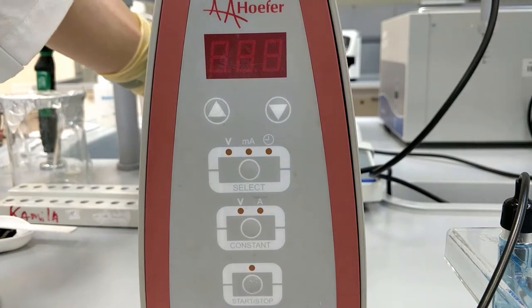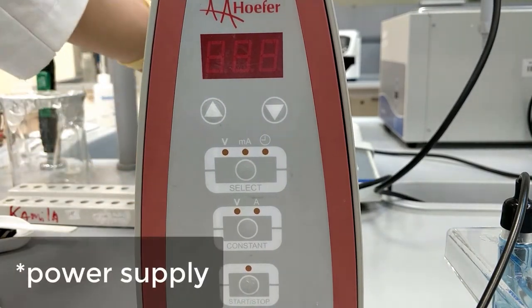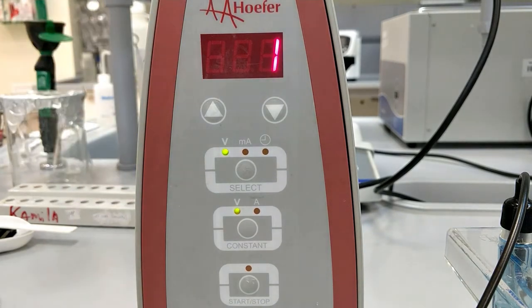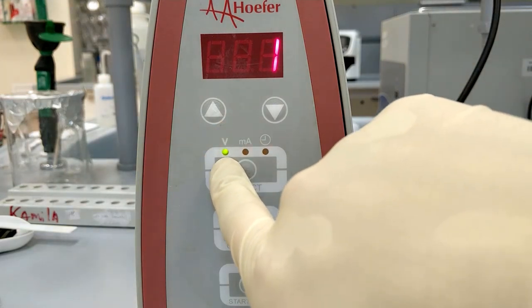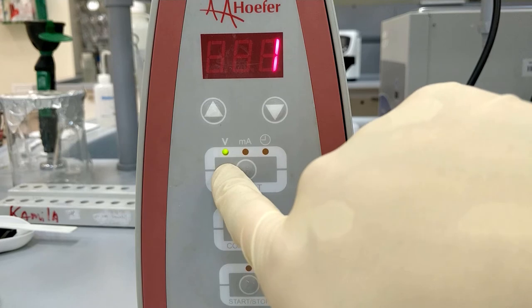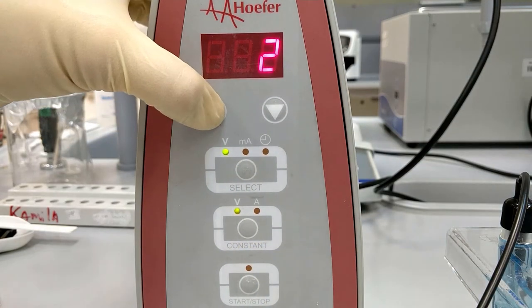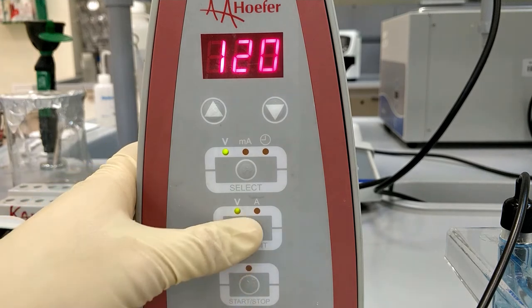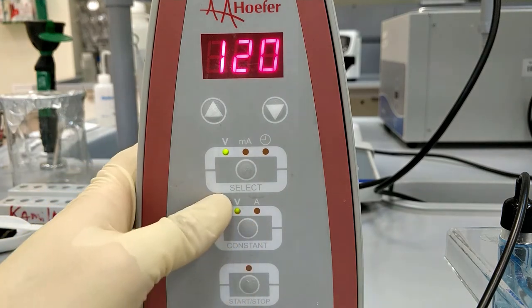We turn on the power supply and we need to set the voltage. We are going to set it to 120. This will be constant — voltage is constant.